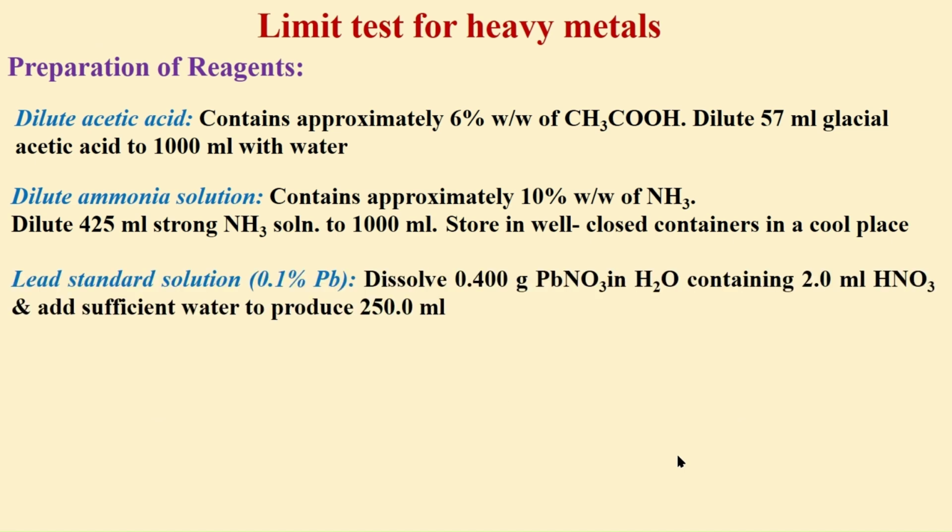in a cool place. Standard lead solution, 0.1% lead solution, is prepared by dissolving 0.4 grams of lead nitrate in water containing 2 ml of nitric acid, and it is diluted with sufficient water to produce 250 ml.